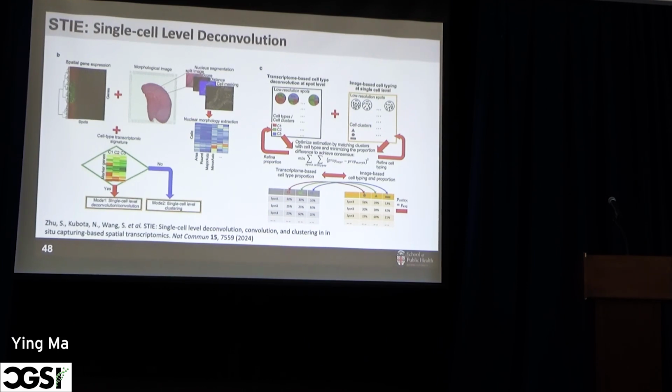So here, what it means is that they believe each location has multiple single cells. And these single cells, you can only get the information from imaging segmentation. So their novelty is they first perform the imaging segmentation, identify these cell masks and the nuclei information, and then also get these imaging-related embeddings, such as representing the area or size or the axis.